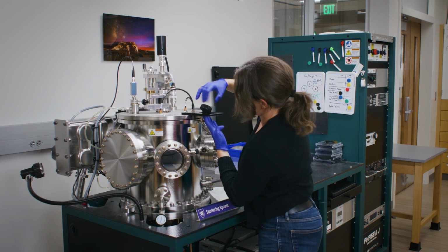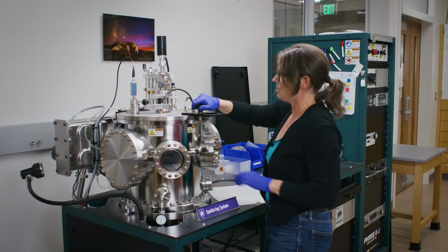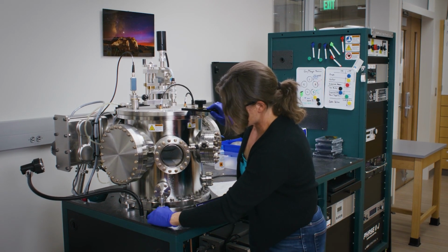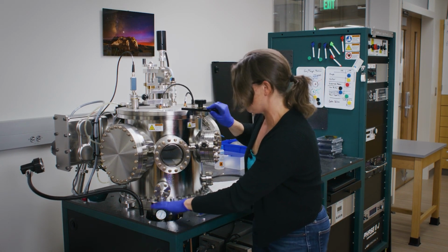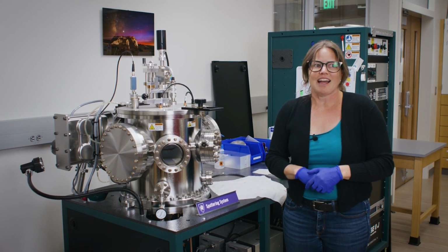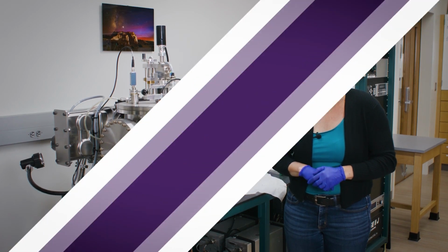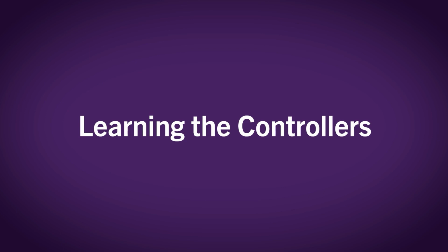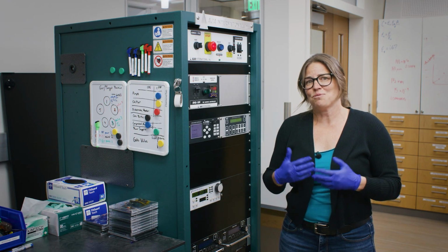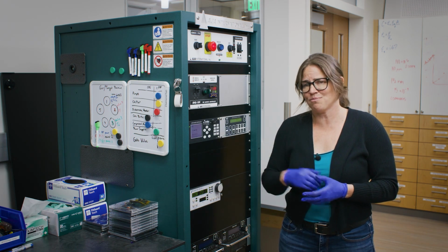We have this little knob that we come up here and we can tighten down. You always want to do this at atmosphere and not when we are at vacuum. And then we want to check that our valve here is fully closed off, because this lets air into our system to vent. And now we are ready to start pulling the air out with our vacuum pumps. All right, so now our chamber is closed up. We're ready to start pulling the air out of our vacuum chamber.